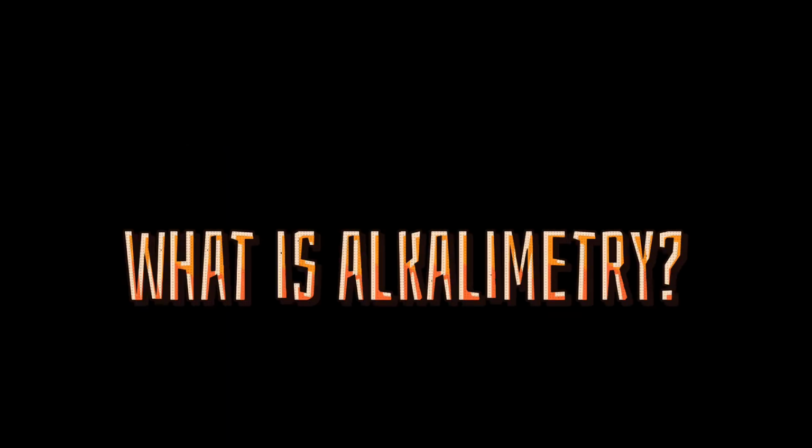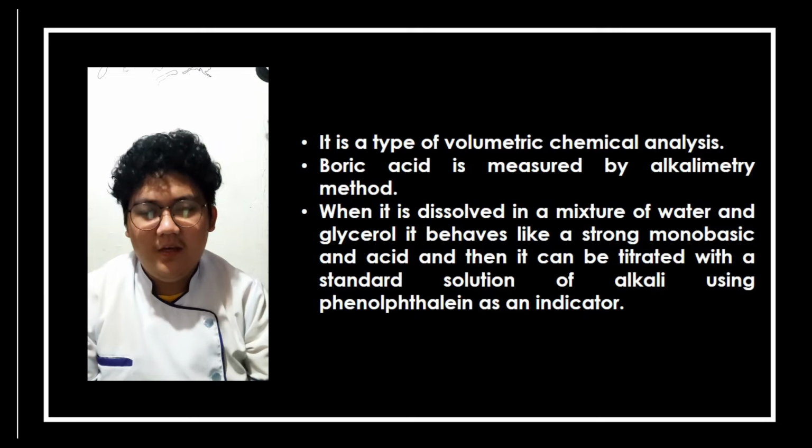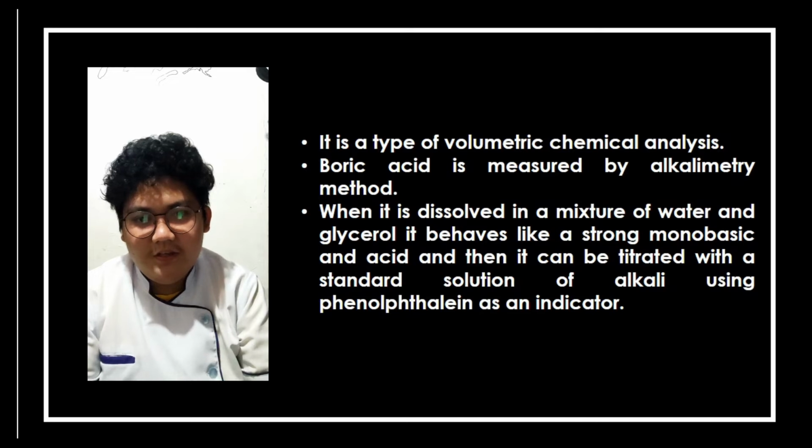What is alkalimetry? Alkalimetry is a type of volumetric chemical analysis. Inaalaw niya tayo na ma-determine yung level ng acid solution using an alkaline solution of known concentration and a sufficient indicator. Example niya yung boric acid. Measured siya by using the alkalimetry method.